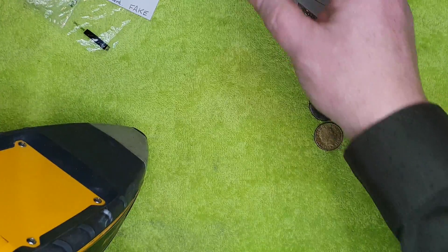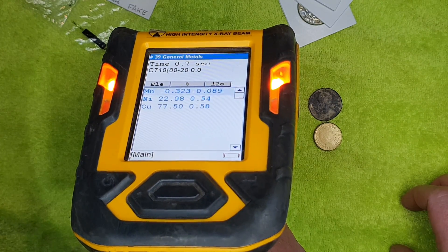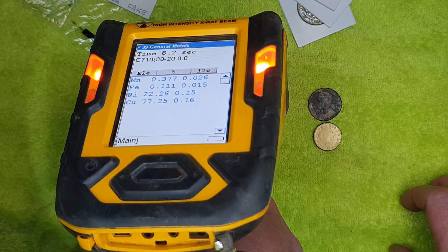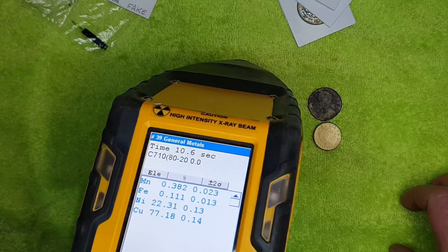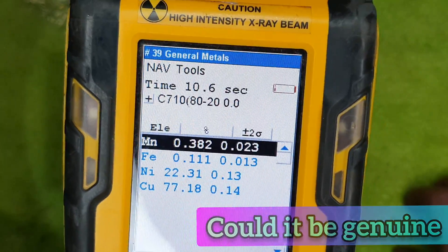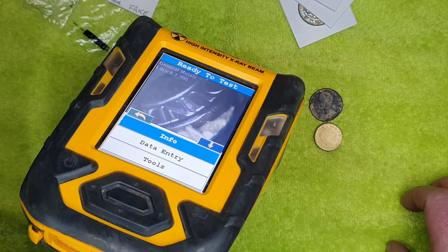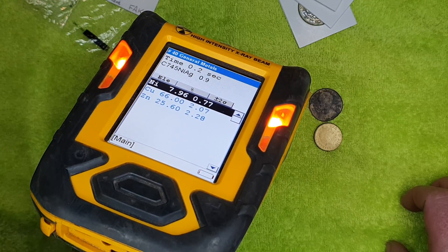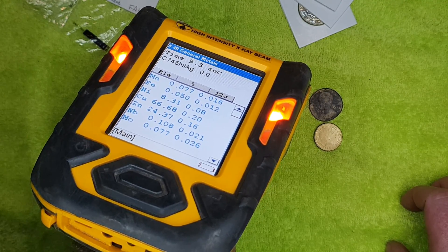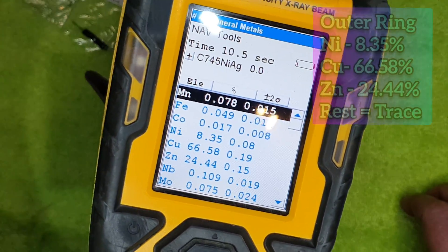Right, now we'll go for one of the fake ones. I'll pop them back in. You're best off in the center of these. If it's doing that, I can try and get it. Nickel copper — so that's about 80%, giving up 77/22. It's picking up all sorts of different little things. You can see on that camera where it says 'pound.' So that's got zinc in it — there's all sorts in that.